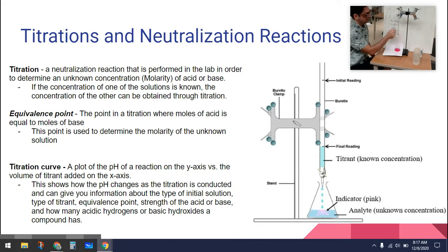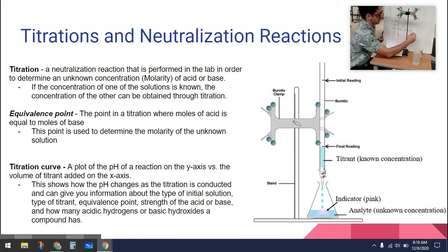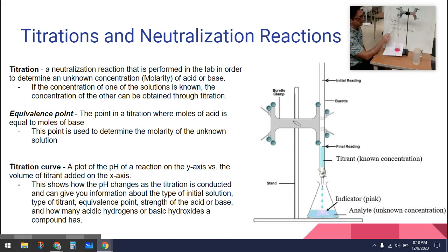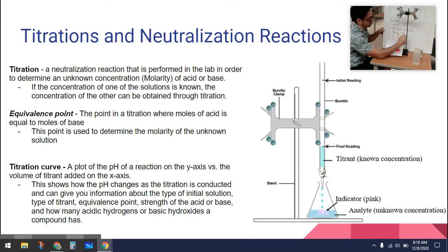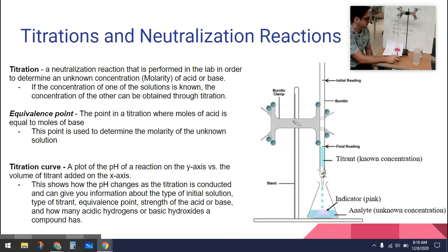So 27.4 minus 17.4 gives us 10 milliliters added. The base is 0.1 molar, and I had 10 milliliters of acid in solution. I can find the molarity of the acid using this equation: molarity of the base times volume of the base equals molarity of the acid times volume of the acid. Solving this, we get the molarity of the acid to be 0.1 molar — and that's exactly what it should be.